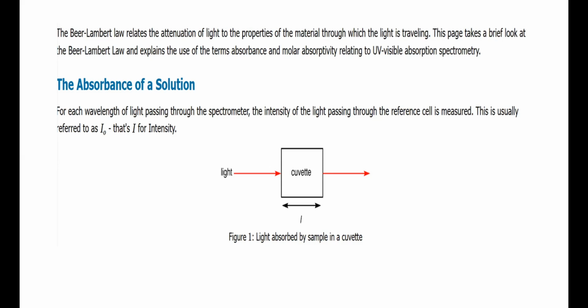Then you are not going to have the reading on the transmitted light, right? So there ends the limit of the Beer-Lambert's law. At a particular concentration, the law cannot be applied to find out the concentration of the analyte in a given sample.